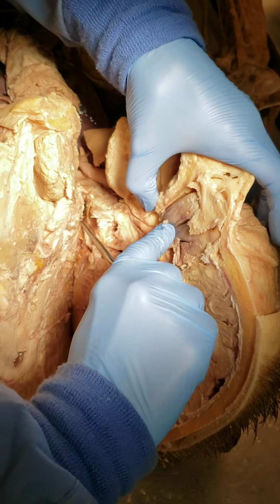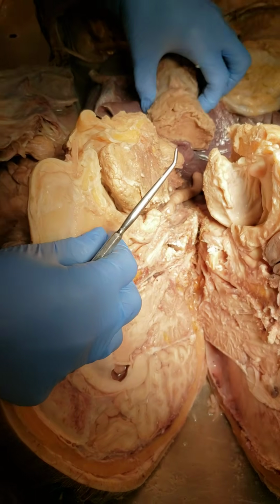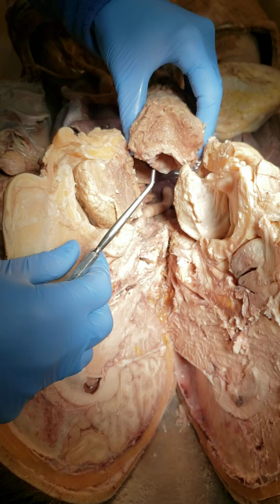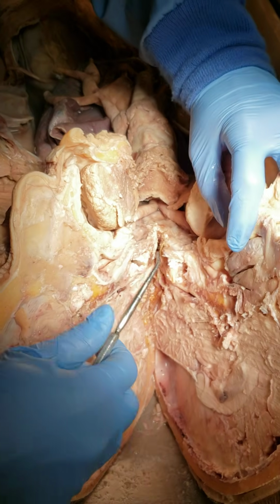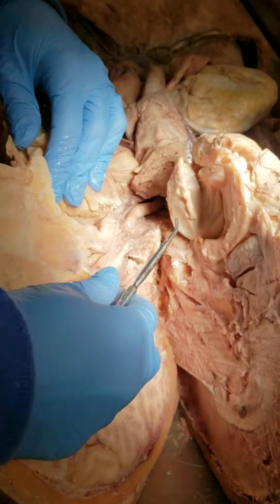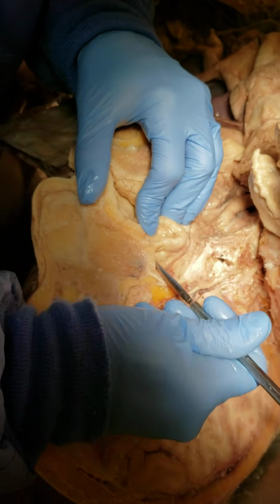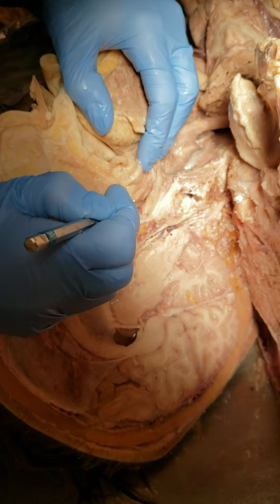Now, certain things to point out here. Keep in mind, we did remove the larynx and the trachea. So we'll identify some of those features in a little bit, but I did want to point out, if I go to this side of the cadaver, this would be the opening.